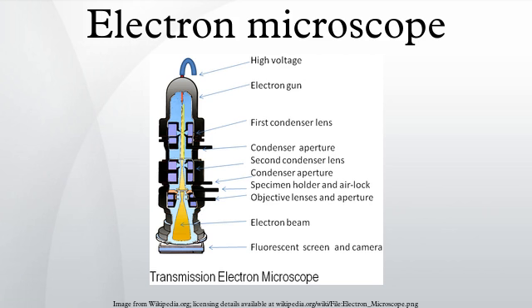Scanning transmission electron microscope. The STEM rasters a focused incident probe across a specimen that has been thinned to facilitate detection of electrons scattered through the specimen. The high resolution of the TEM is thus possible in STEM. The focusing action occurs before the electrons hit the specimen in the STEM, but afterward in the TEM.